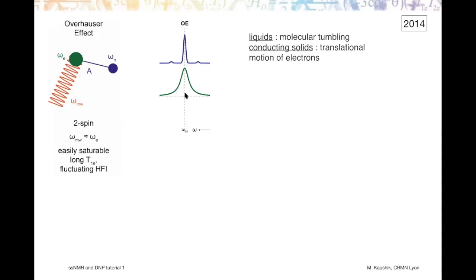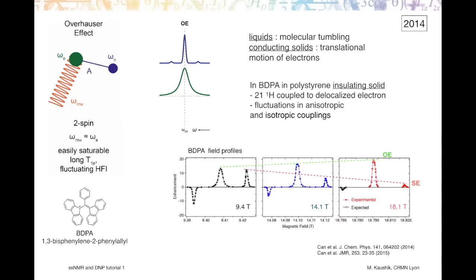It essentially works by the difference in relaxation rates. And this Overhauser effect is a simple zero quantum or double quantum effect, where this difference in rates can lead to either positive or negative enhancements by Overhauser.